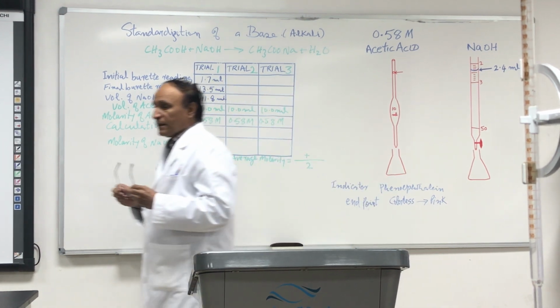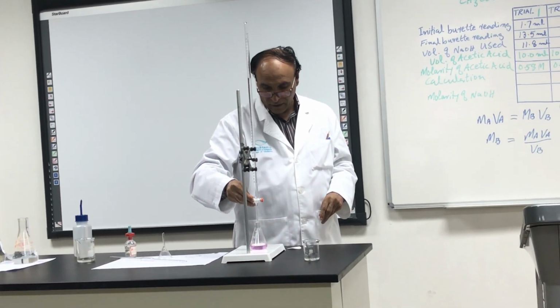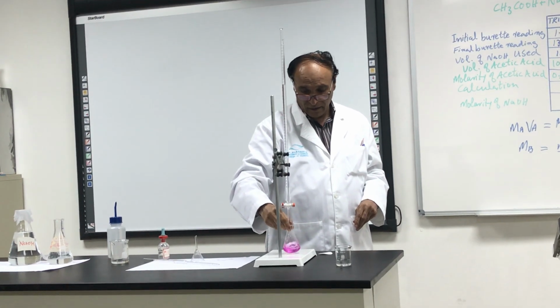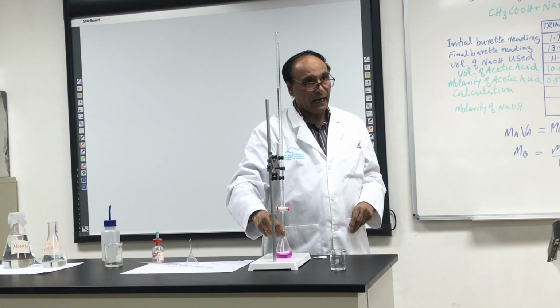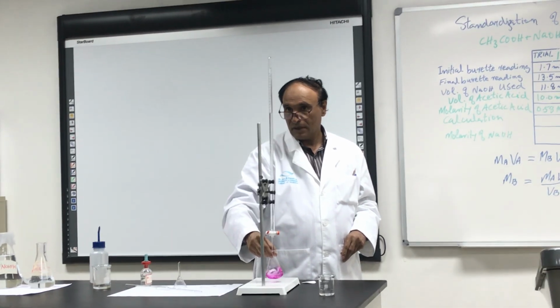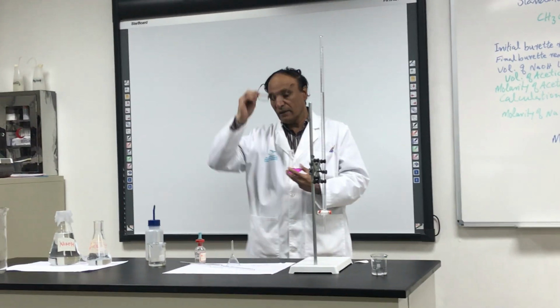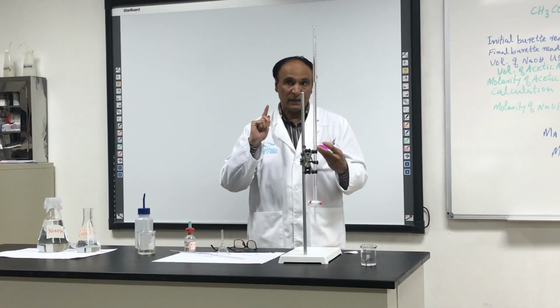Okay? So listen, if I add more after the end point, the color becomes darker and it will not change. Look over here. It will not change. That's why we want the end point with one drop. Did you understand?